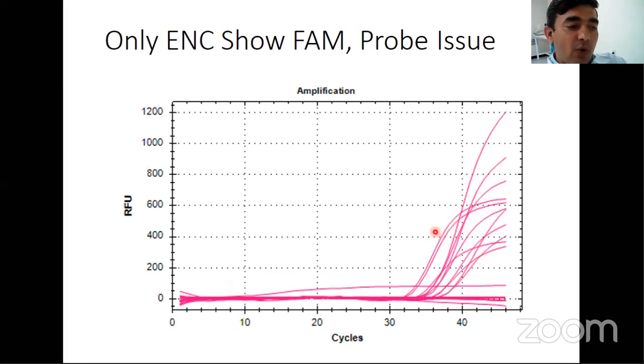I call it a probe breakage issue because we did not put any positive samples in this particular cycle, and no positive amplification sequence is present, yet some fluorescence signaling appears, and this needs further confirmation.